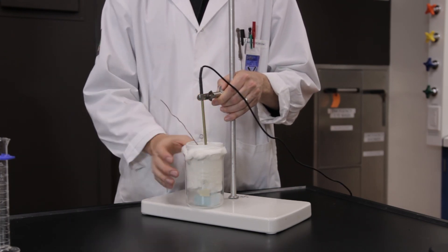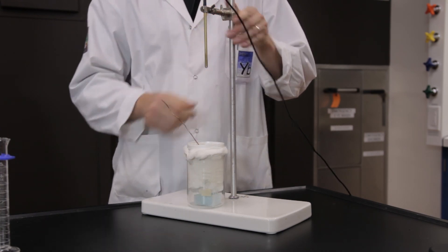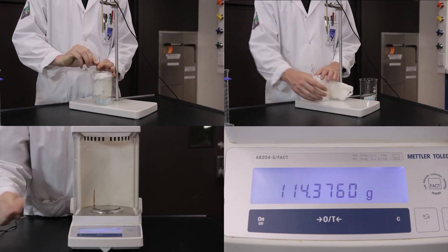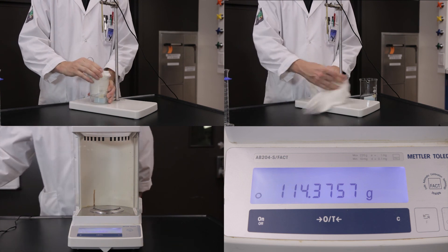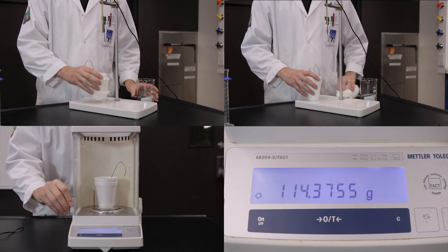Do a final weighing of your apparatus. Be sure to follow all the instructions described in your lab manual on how to use the LoggerPro program. The program is used to collect and analyze your data.